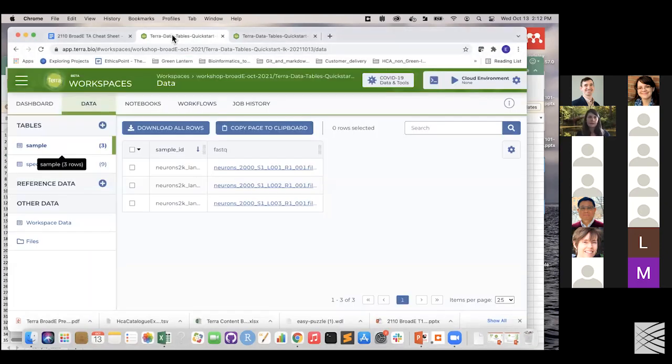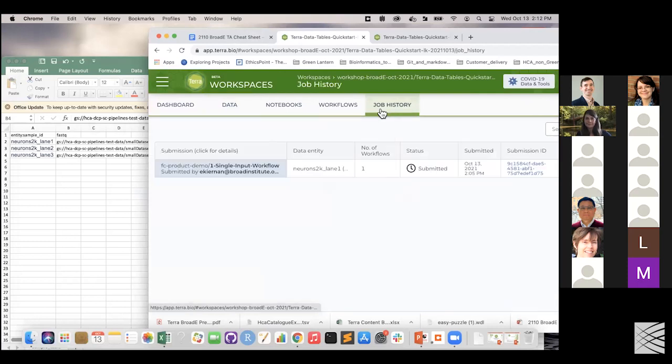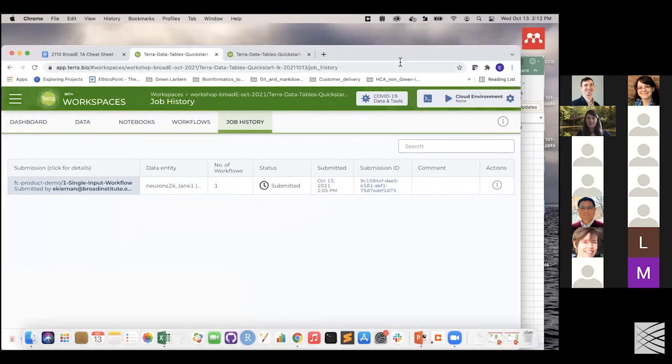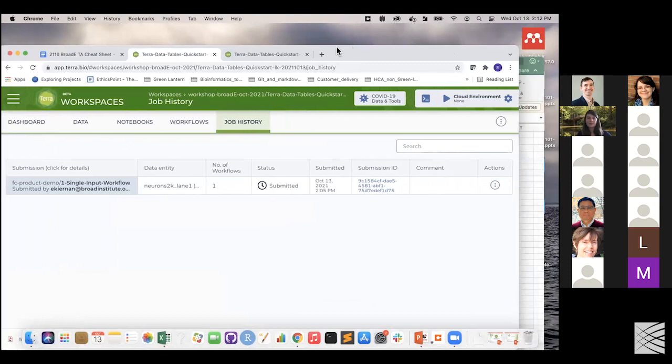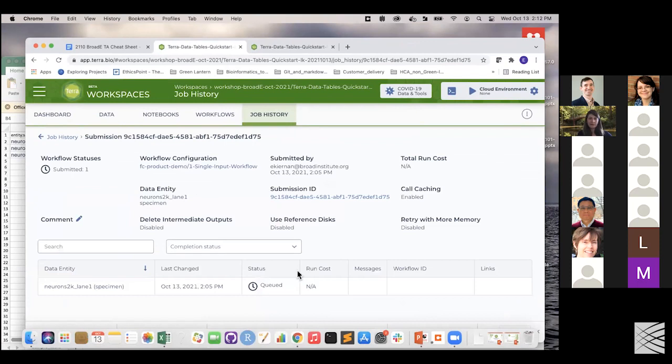And if it was very quick, you could look and see, maybe you could lead through some troubleshooting, or we're going to do a troubleshooting section in a little bit. Yeah, we are going to do a troubleshooting section. When you go into your job history, you might have a failure message here. Did you by chance get a failure message when you did it?